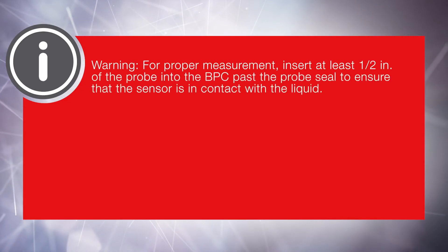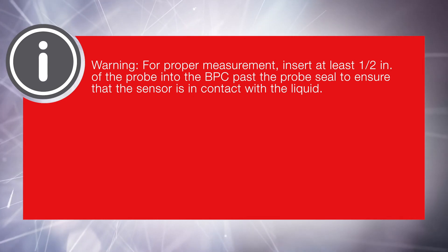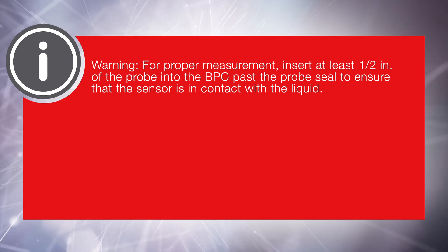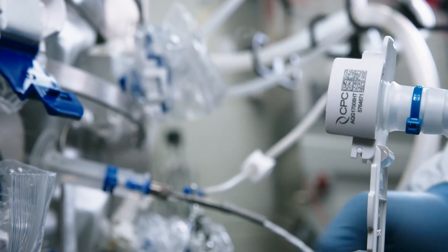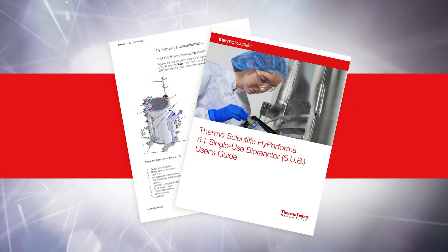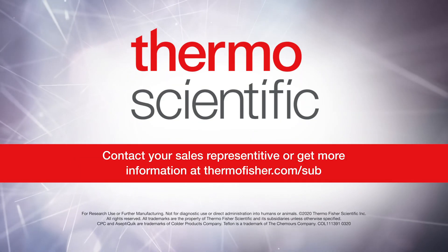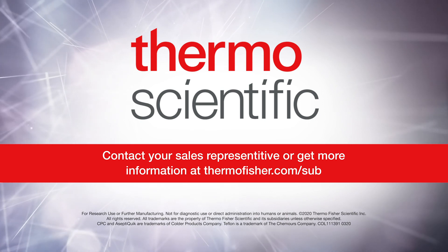Warning: For proper measurement, insert at least one half inch of the probe into the BPC past the probe seal to ensure that the sensor is in contact with the liquid. This completes part three of three videos that cover setup and installation topics related to the Hyperforma 5-to-1 SUB. For further detailed instructions, please refer to the Thermo Scientific Hyperforma 5-to-1 SUB user's guide. Contact your sales representative or get more information at ThermoFisher.com/sub.